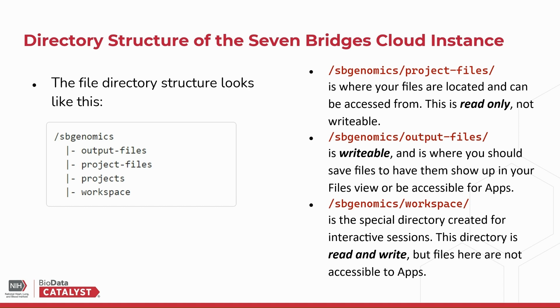/sbgenomics/project-files is where your files are located and can be accessed from. This directory is read-only, not writable. /sbgenomics/output-files is writable, and it is where you should save files to have them show up in your files view or be accessible for apps.